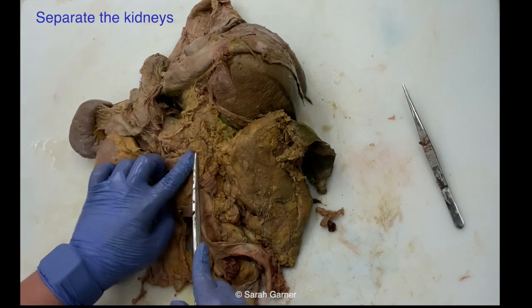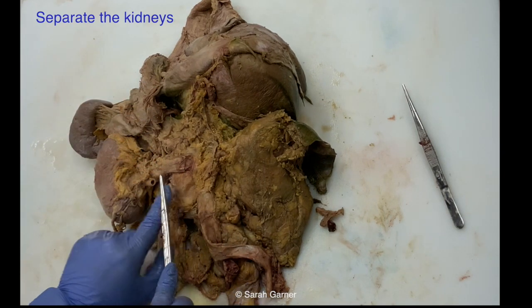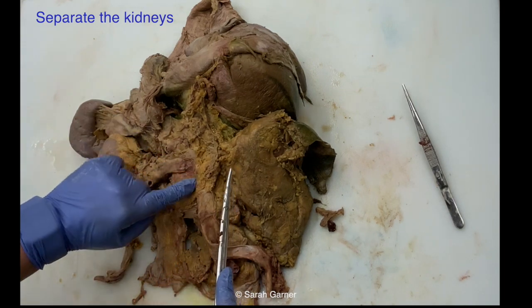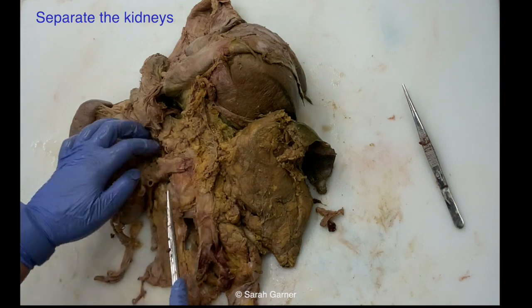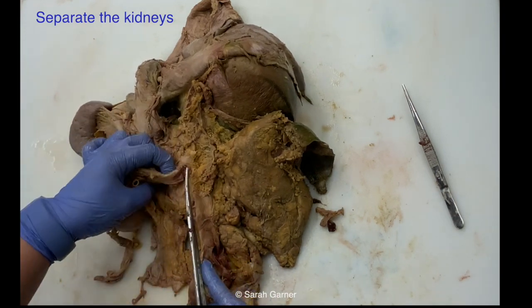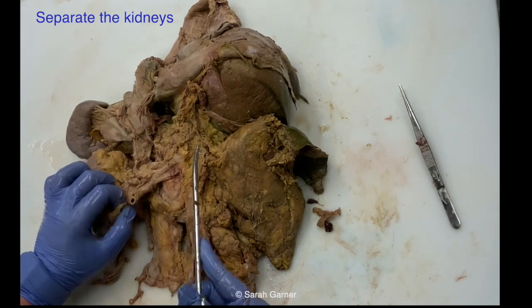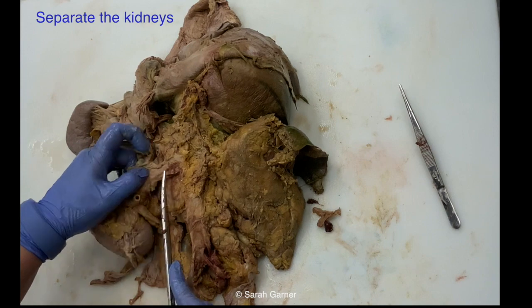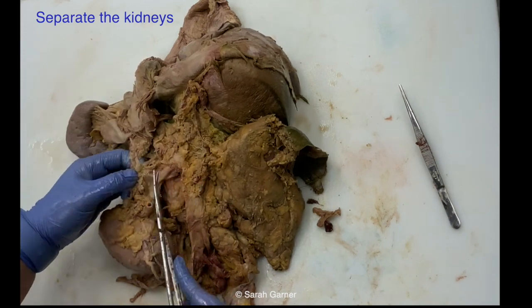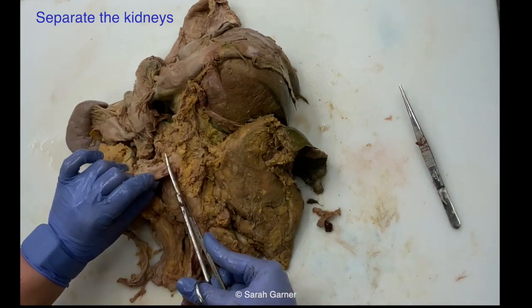So I guess, what is this? We already cut our renal artery here, right? When we removed our aorta. So that's the renal artery cut. This is your renal vein, and then this is your inferior vena cava. So anytime you're cutting something, make sure you know what it is first, because you may need to open this to look for certain things. And actually, really, you should always be opening this to look for anything inside the vessel. So you can do it at this point, or you can do it once you get the kidney actually out and you're examining it.